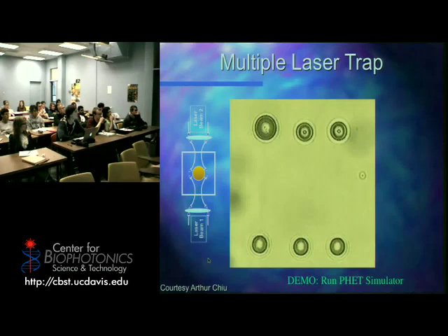But when I grab a cell, I don't have to use as much energy. I can focus my beam down to about a micron. I can grab a cell. Now, I've grabbed that cell. And we do this all the time. This is happening right now at Oak Park, and you guys will be seeing the instruments that do this. But I've grabbed that cell, and now I can investigate that cell. I can shine specific colors of light on that cell, and I can see how it responds.